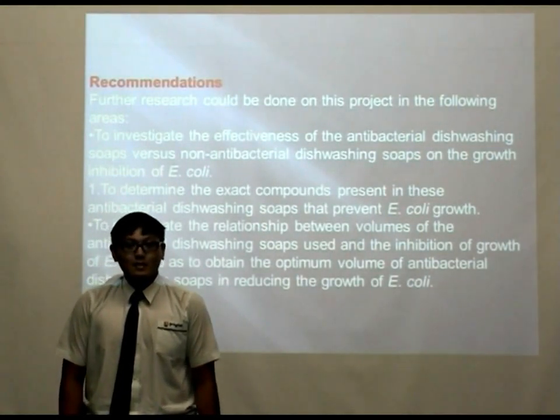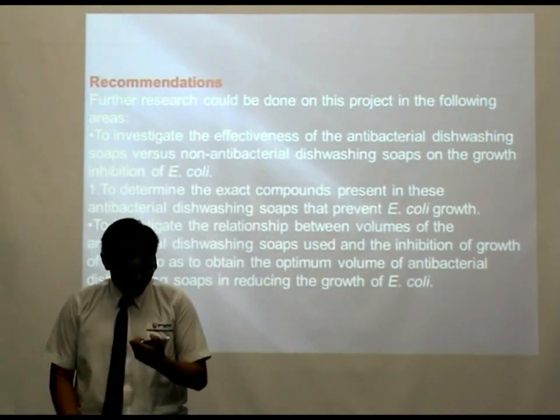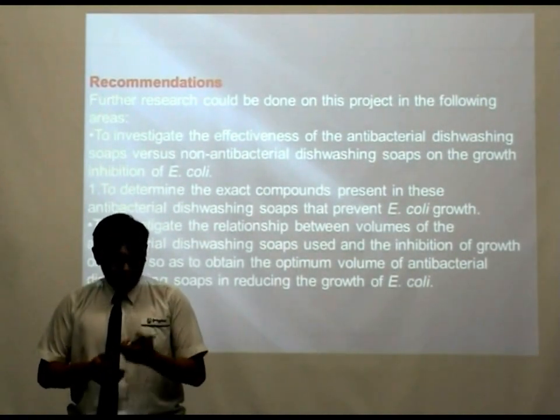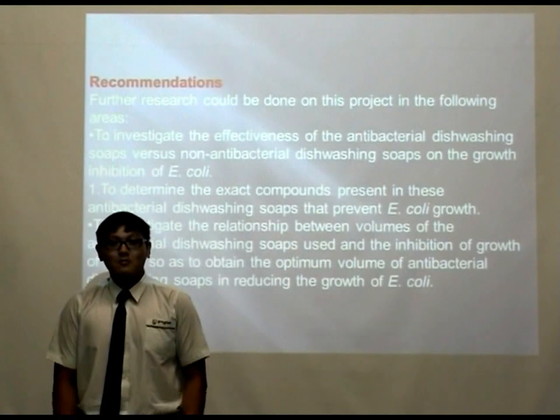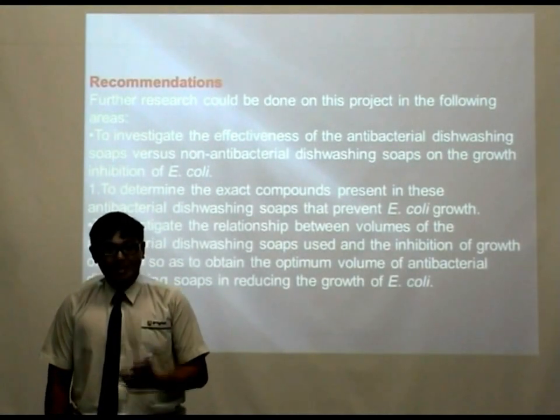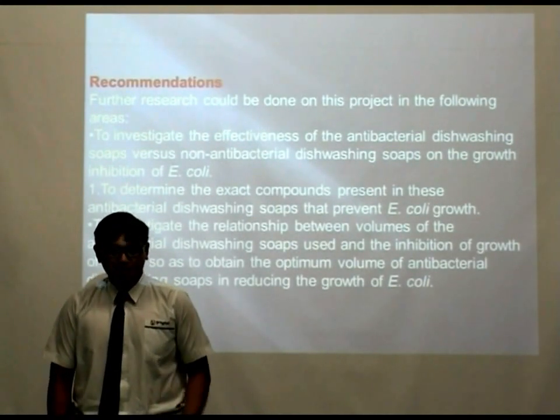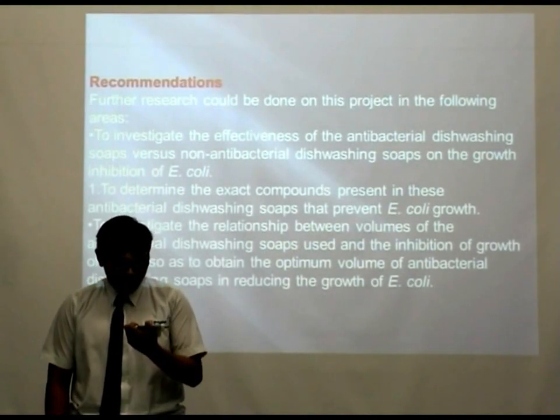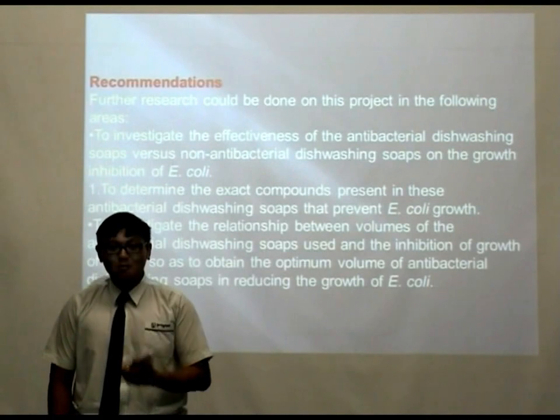And thirdly, is to investigate the relationship between the volumes of antibacterial dishwashing soaps used and inhibition growth of E. coli, so as to obtain the optimum volume of antibacterial dishwashing soaps in reducing the growth of E. coli.